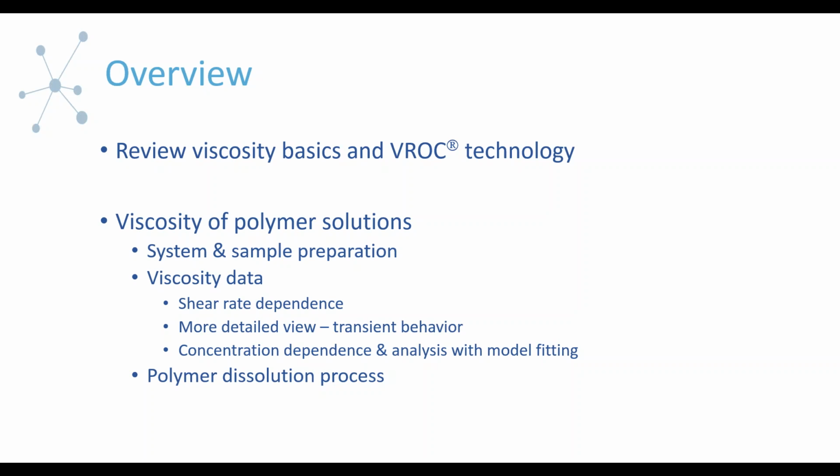It was a little hard to lay this out exactly as we go through it, but we're also going to talk about the polymer dissolution process and how this is important when you're doing your sample prep and what it can mean when you are collecting your viscosity data.